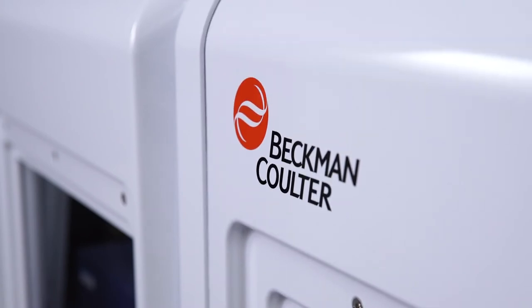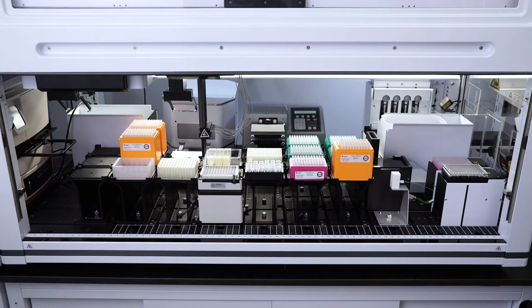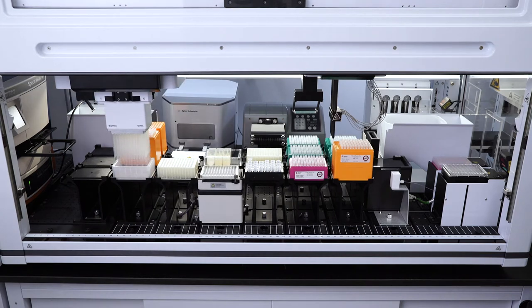Biomech i-Series liquid handlers from Beckman Coulter Life Sciences offer you a simple way to automate your ELISA protocol. You can automate your entire workflow from beginning to end on one Biomech workstation, or you can automate parts of it based on your bottleneck.